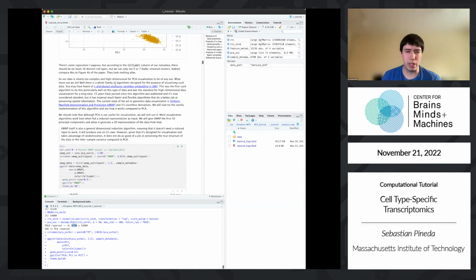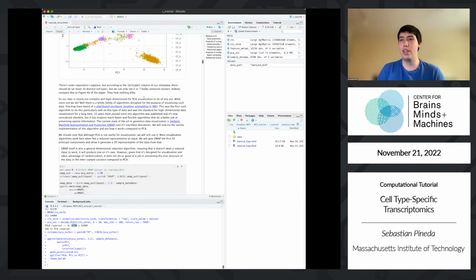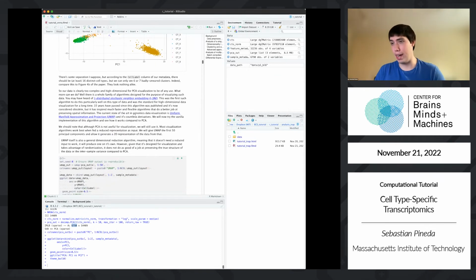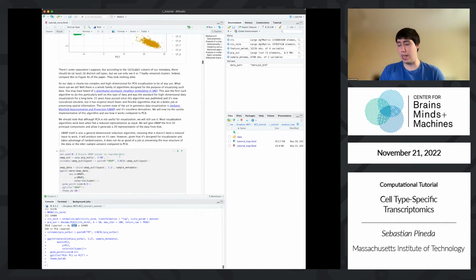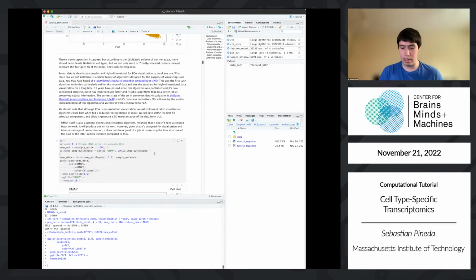So we don't use t-SNE much anymore because it turns out that there's even better algorithms for it. Although very popular now, fairly ubiquitous, it's called UMAP. So I'll use that one as an example. And this will give us a much better two-dimensional projection of our 14,000 dimensional data. Now, although UMAP itself does the dimensionality reduction, it works better if you give it the PCA already, because then it has less features to worry about optimizing. So we're going to do that.